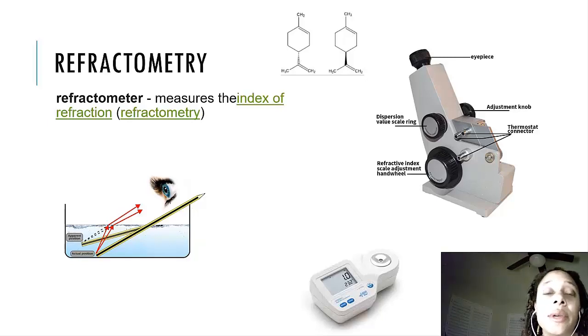And so with the refractive index, we can calculate the angle of incidence, like what degree it shifts light. The example I have here is this pencil in the water. When you look at it, how light affects it makes it look like it's changed position a little bit. So that is how light affects that material.